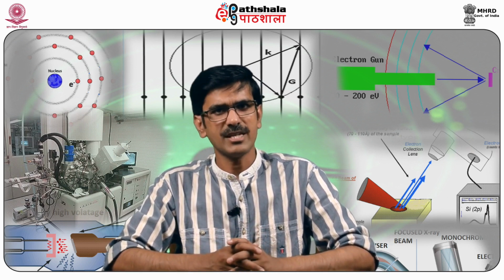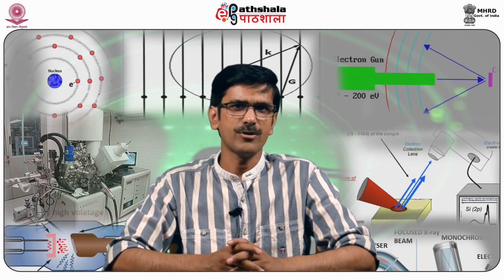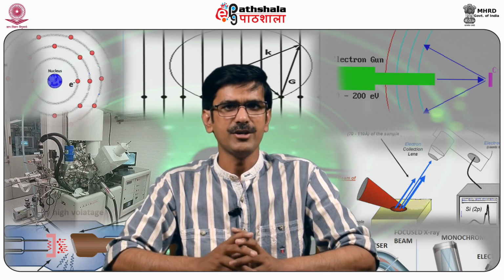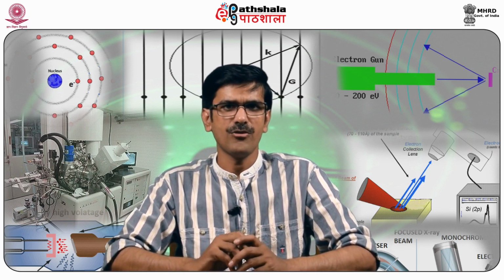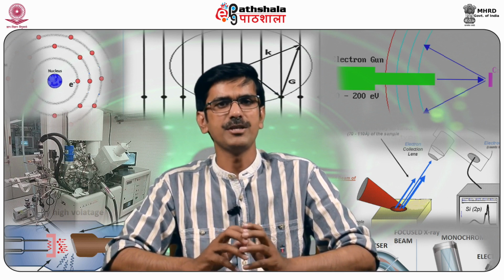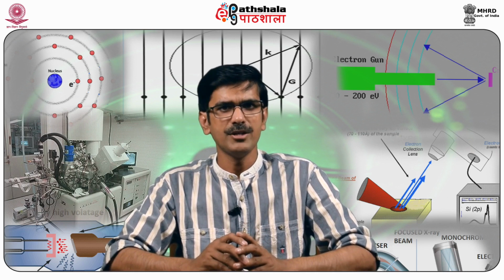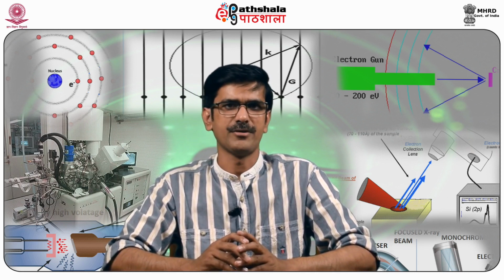The electron beam scans in a pattern called the raster scan pattern, which is also known as a rectangular pattern of capturing an image and reconstructing it on a screen. The position of the beam is combined with the detected signal to produce an image. In your mind, there must be a question: what is a raster scan pattern?